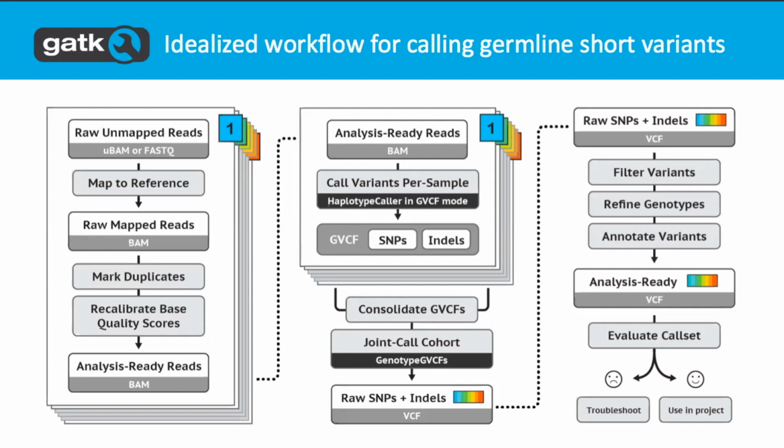So what's the risk there? For us, and it kind of goes back to my earlier answer about the batch effects, we do try to process everything in the same way. When we're doing a joint calling, we pin all of those samples, we process them in the same way. There are sometimes a few minor changes that we allow if there's been a small bug fix and we understand really well what has happened and what has changed. But for the most part, everything in a particular project gets processed in exactly the same way.